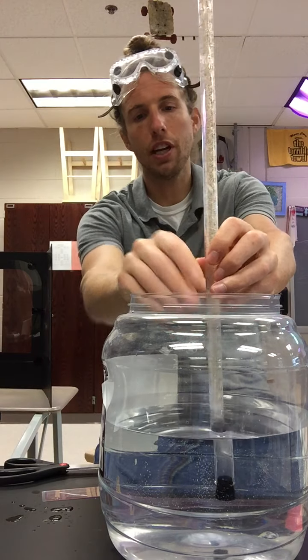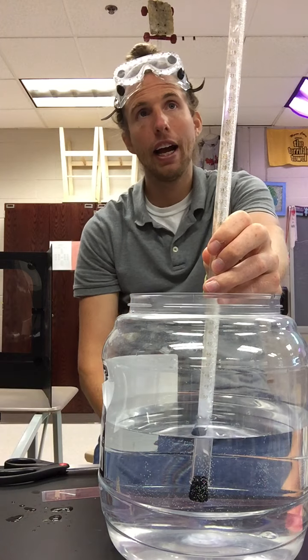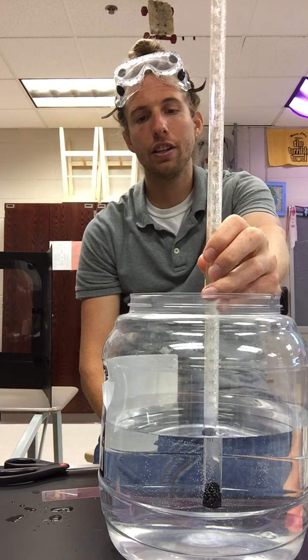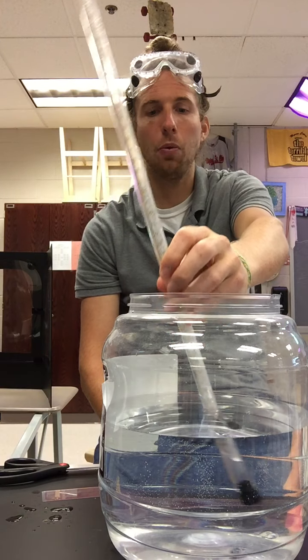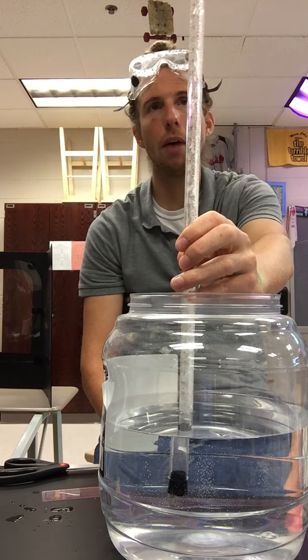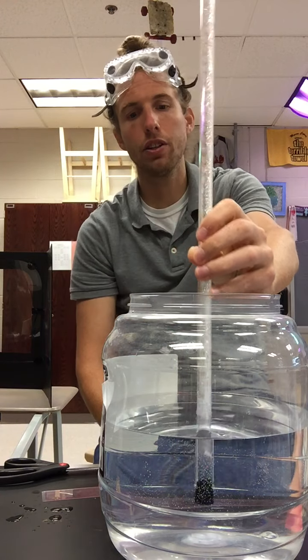We're getting a bunch of bubbles. I gave a little swirl to hopefully get that acid down there. And as it reacts, it's hard for you to see, but if I lower this down a bit, oh, you can't see it yet. We're going to see that there is gas at the top of the eudiometer. We have, at the moment, right around 5 milliliters of gas.